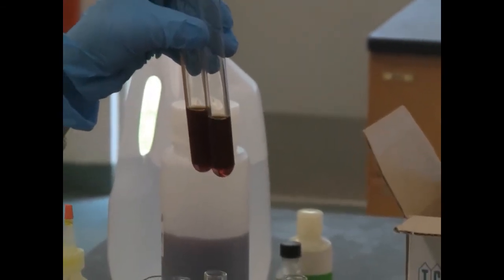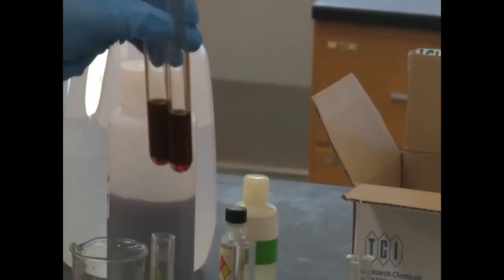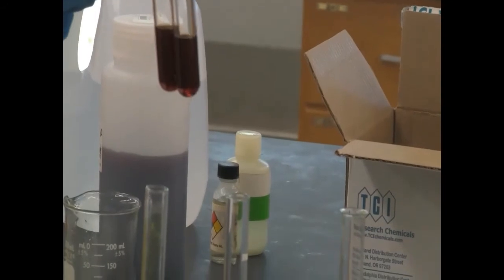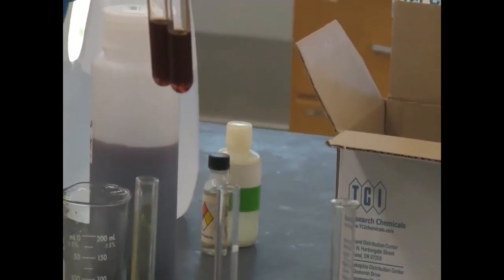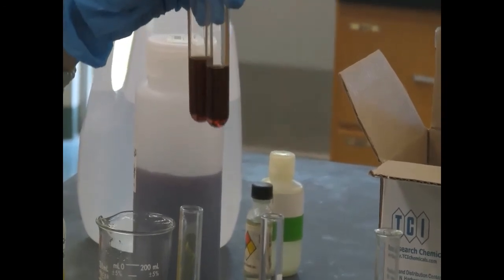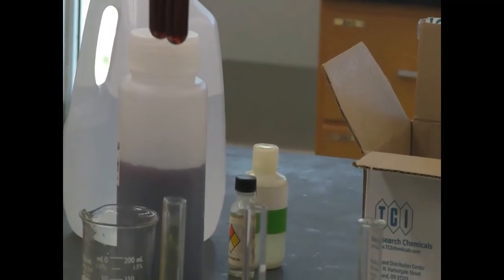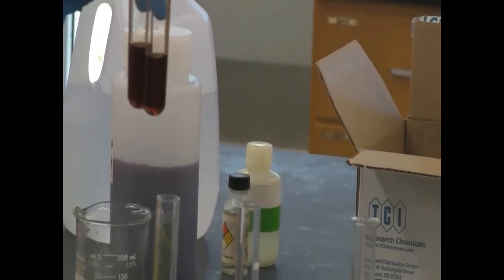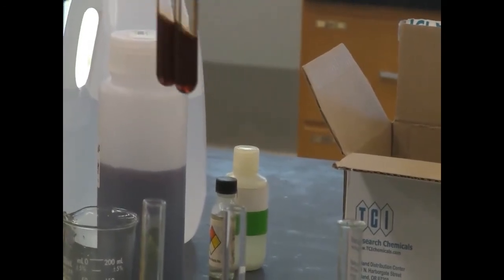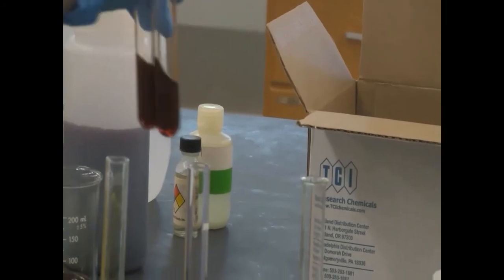What we expect to see should be a darker red color here. Think about why, because there is an explanation on there. It says what we expect to see and why we have that kind of result. So now the result looks like almost no change here. But I can tell you, it should be a little darker color here. Try to explain why number 2 should be darker.